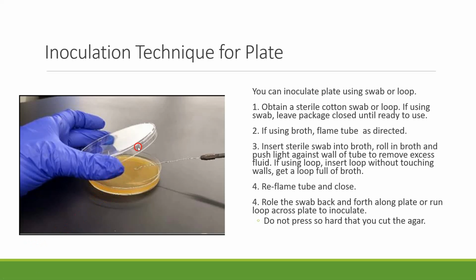A couple of things to point out. Notice that here, when we're working with the petri dish, we did not just take the lid off and set it on the countertop, because the countertops are contaminated, so that would get our plate contaminated. Not only that, think about the air around it. Things are constantly falling from the air. If you hold the lid of that petri dish at a slant, any air particles will hit the top of that lid and will not get onto the sample, so it won't contaminate your sample.